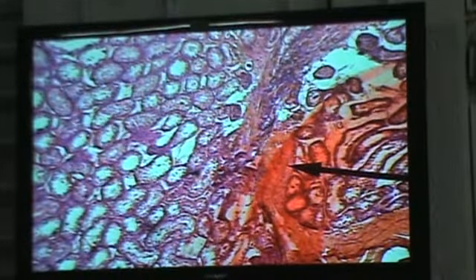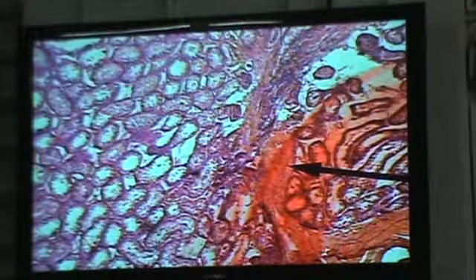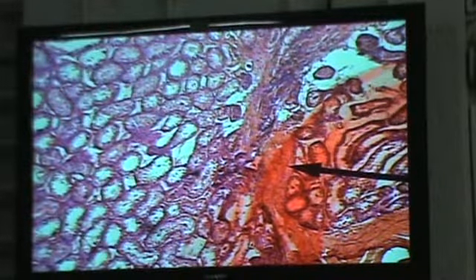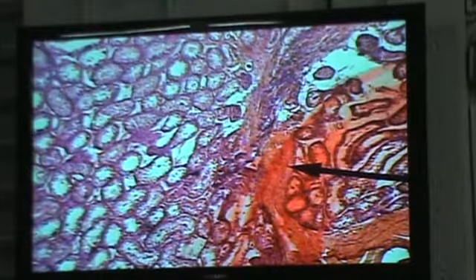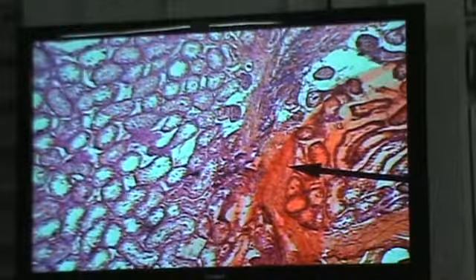Alright, so yeah, beautiful. Okay? So there you can see the mediastinum testis. There you see the septulae testis, and you can see the seminiferous tubule just leading now into the straight tubule, and then into the mediastinum, which is the rete testis, and then about 10 or 12 or so ductuli efferentes coming off to lead into the what? Into the epididymis. Okay?